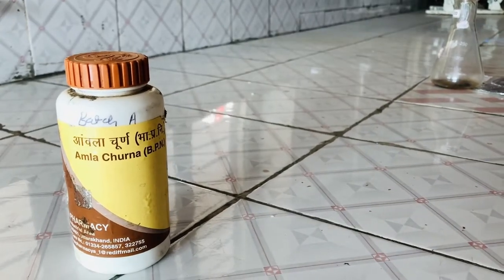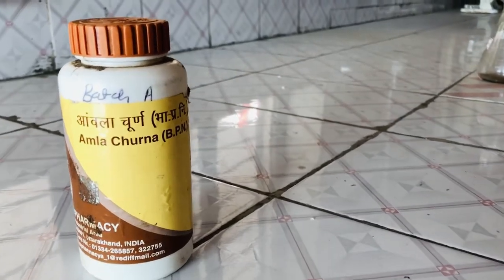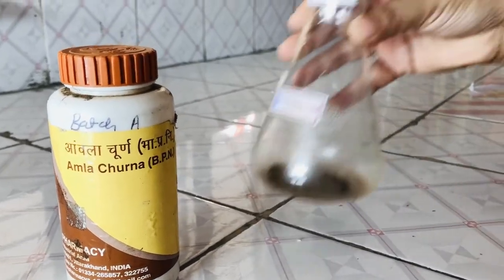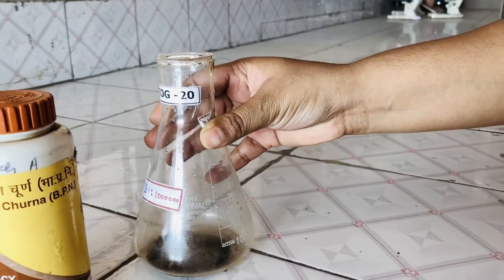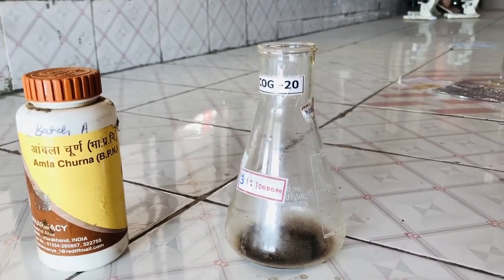We are going to start with the phytochemical screening test and we have chosen amla as a tannin. We have weighed out 5 grams of tannin, that is amla, and we are going to add to this 50 ml of distilled water.